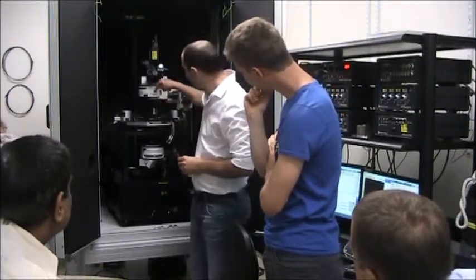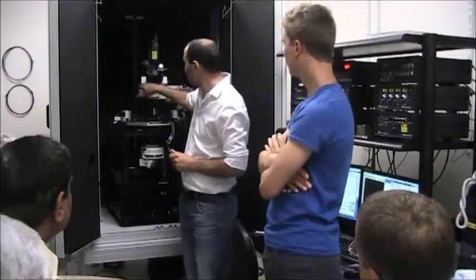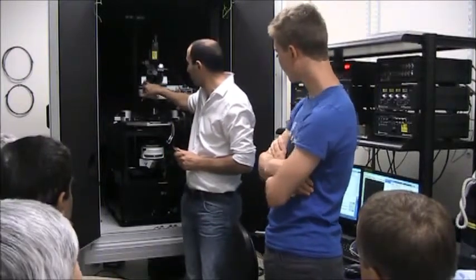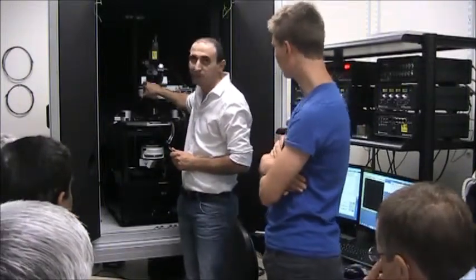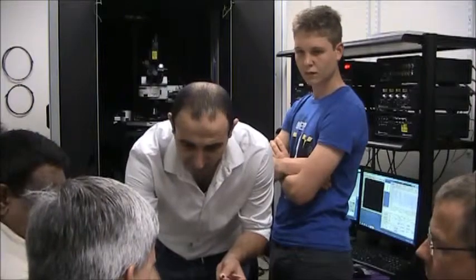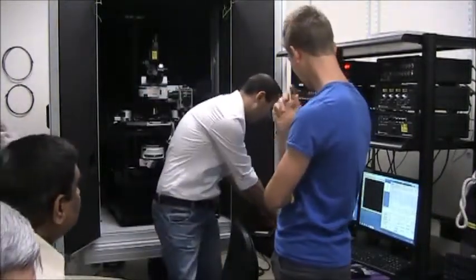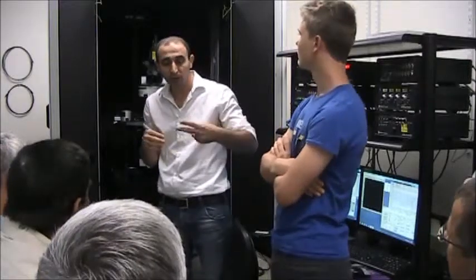You would have the beam coming through the objective and reflected back to the photo detector, which also will sit here in an intermediate module between these 2 components. So you could have a separate AFM system working in optical feedback, an AFM system working with tuning fork, and it's still possible to use optical feedback as well.